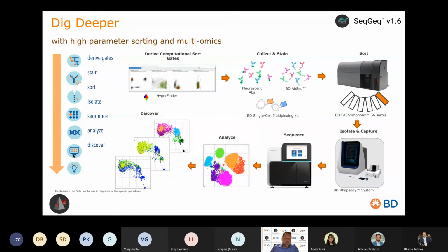And if you don't know about this yet, it is a hot topic in immunology, and many groups are rapidly developing their ability to use this technology so that they can actually look at the RNA transcription profile of the cells that they sort. And it's an expensive technology, so that's why we sort, because the most expensive piece is actually the sequencing. And if you sequence hundreds of thousands of cells, well, that's going to cost a lot of money.